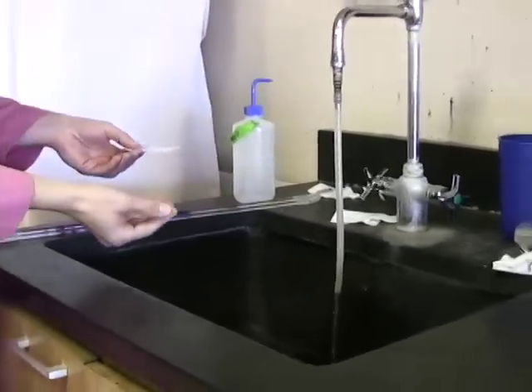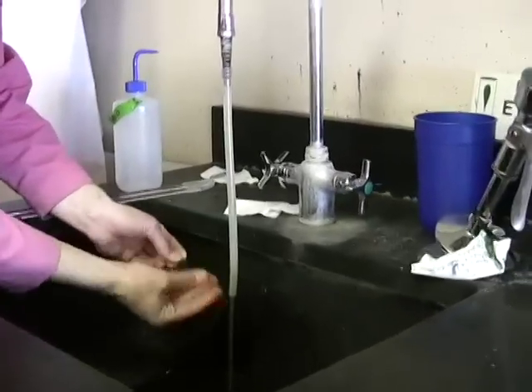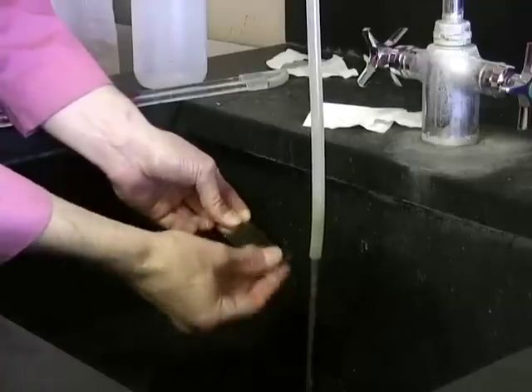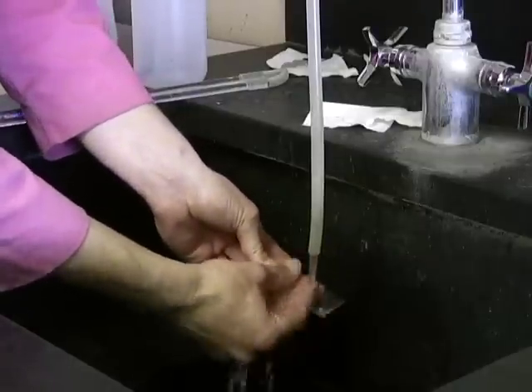In order to ensure that the smear preparation for your unknown is of the highest quality, it's important to begin by thoroughly washing your slide. Make certain to use some soap and water, rub it down well, and leave no traces of oil and debris on your slide.